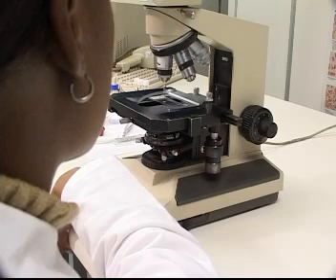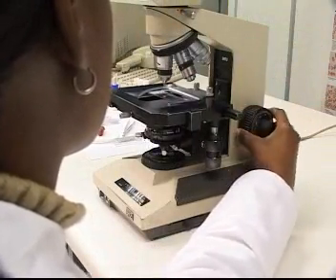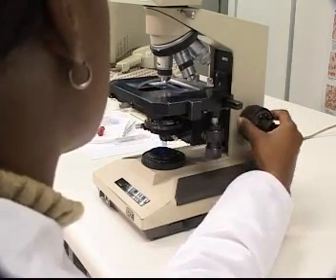Here are some important points to remember in focusing. Firstly, never focus upwards or downwards without looking at the objectives from the side of your microscope, in case your objectives are too close to the slide. Remember, with the high power objective or an oil immersion objective, if your microscope has one, you should never focus using the coarse adjustment. Always use the fine adjustment, otherwise you may break the slide and possibly damage the lenses of the objectives.